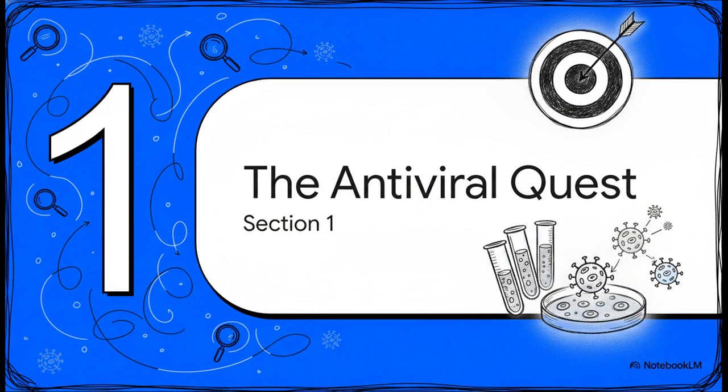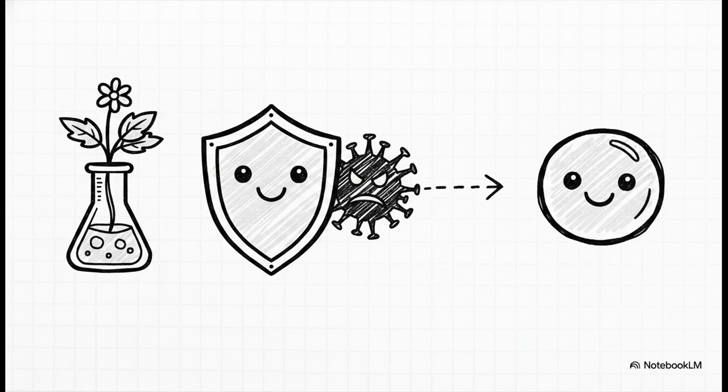You know, every great scientific journey starts with a really clear goal. And when it comes to virology, finding new antivirals, that is a massive quest. So, our mission, should we choose to accept it, is pretty straightforward, but also super important. Can we find something, we'll just call it an extract, that can stop a virus dead in its tracks? This whole assay is basically a screening tool. It's that first critical hurdle to see if a compound is even worth a second look.